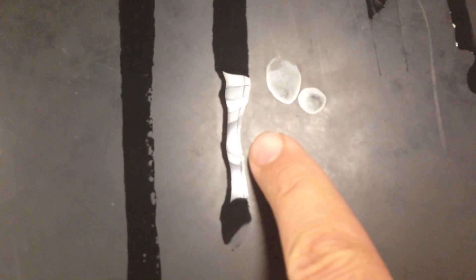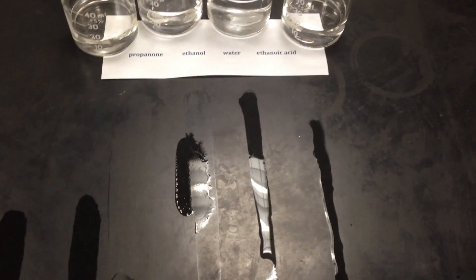Look how the ethanoic acid looks like it's disappearing, but it's just attracting each other so strongly it's making a thicker line right there. Alright, anyway, that's a demonstration. Thank you.